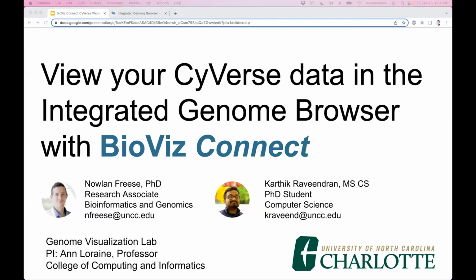Today's webinar is on BioViz Connect, and it's a great example of how researchers can extend CyVerse for their own community's particular needs by using our APIs to access backend services, in this case, to create a custom web application for genomics, visualization, and interaction.